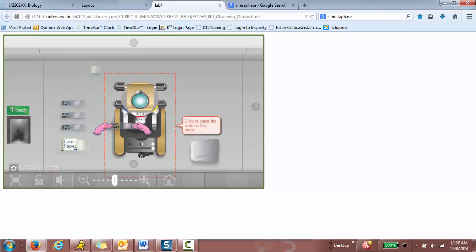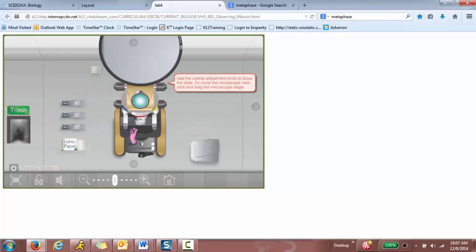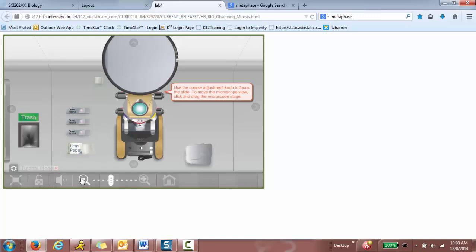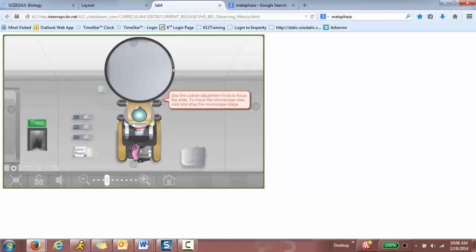Click to place the, use the course adjustment knob to focus the slide. To move the microscope view, click and drag the microscope stage. So you're going to click and scroll up or down to focus, but I still can't see anything. So what I'm going to do is move the stage.